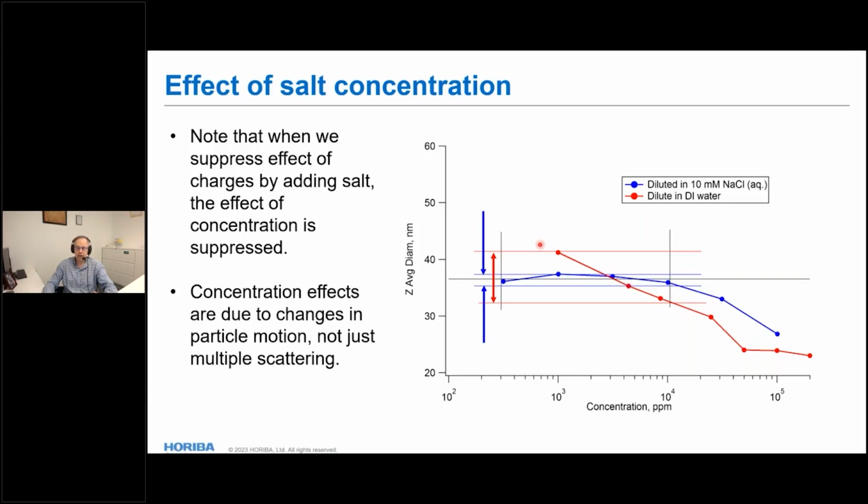And so this tells you, as you move to higher concentrations, what's going to get you first is often interactions between particles, much less so than any optical effects, because it's the same optical system, same concentration, light behaves the same way, it's just how the particle motion was changed. So you want to think about suppressing long-range interactions as you make measurements.